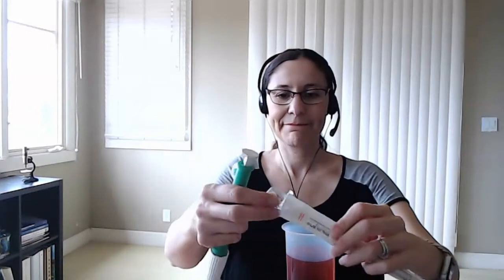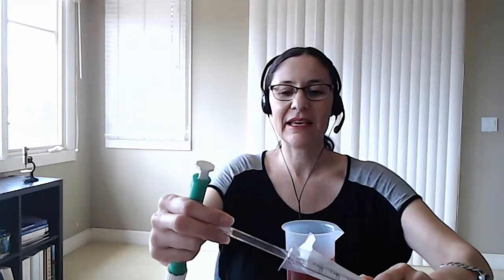So let me show you now how we use our pipette to draw volumes. Here you see that I have some colored water to make it easier for demonstration purposes. And so I'm going to use my 5 ml pipette. It's okay, I can use my 10 ml pipette. It's the same. So I insert where the cotton plug is onto my pipettor. It's a tight fit because it's a brand new one.